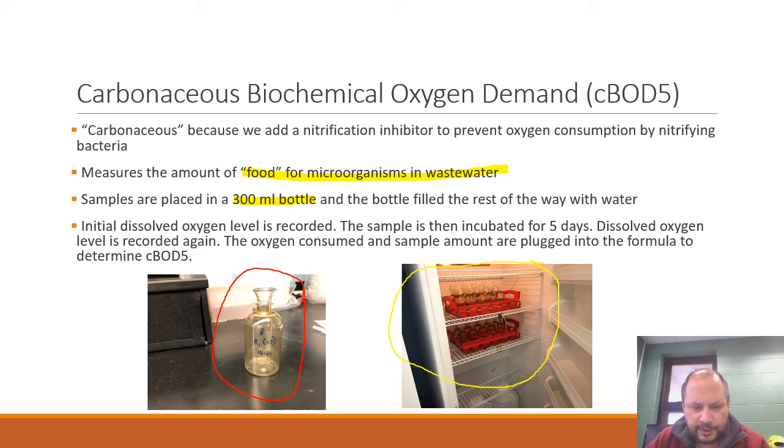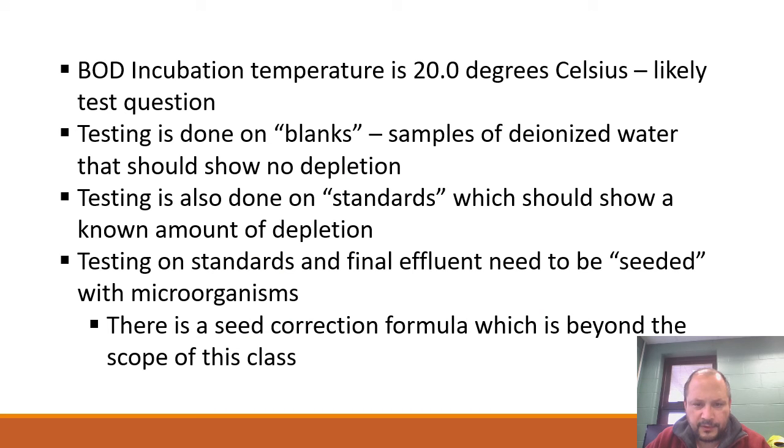Two things that you might need to know for the exam would be 5 days. The incubation period is 5 days. And then the second thing you probably are going to want to know is that the temperature of the incubator is 20 degrees Celsius. And that is a question that is pretty common on these exams. What is the BOD incubation temperature? 20 degrees Celsius.